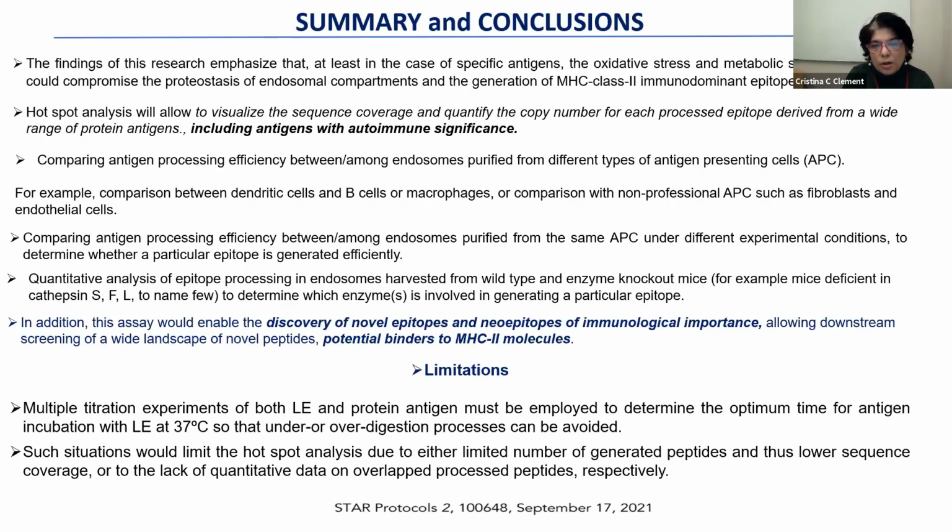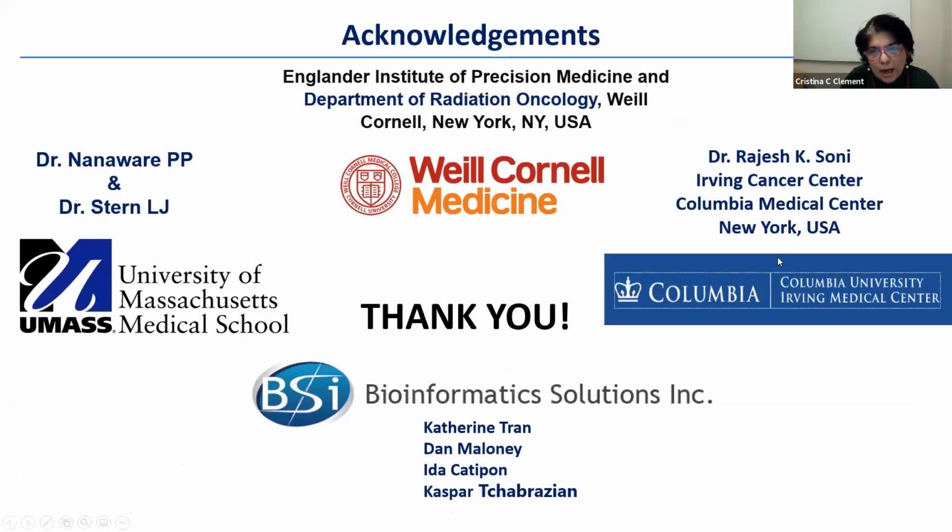There are some limitations, and we discussed this, and titration is required to be sure that you don't over-digest the protein antigens. So altogether, thank you very much. And again, thanks to Columbia for providing the raw files, and to Dr. Stern for contribution to the immunopeptidome, and thanks to Bioinformatics Solutions. Any questions, please?